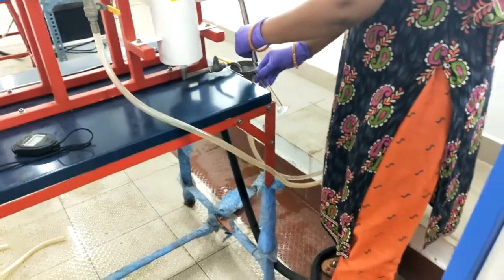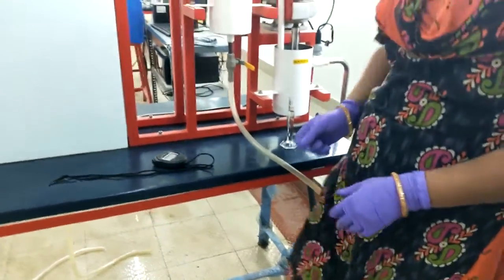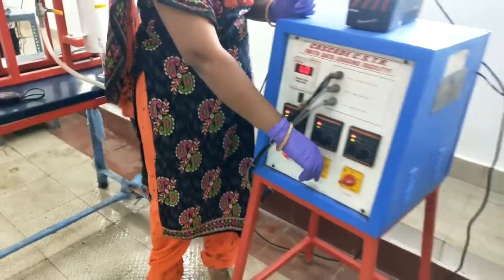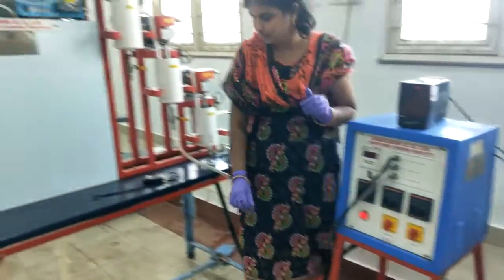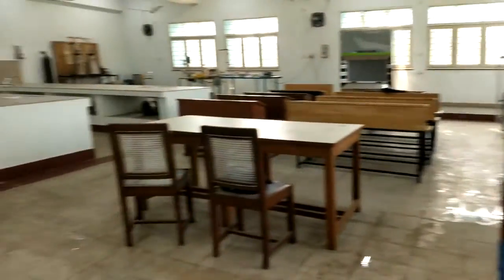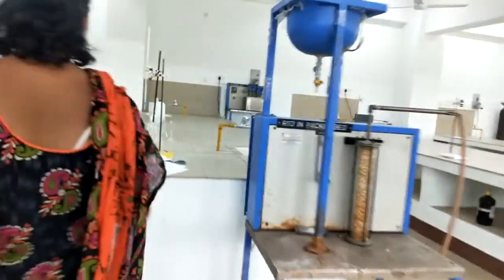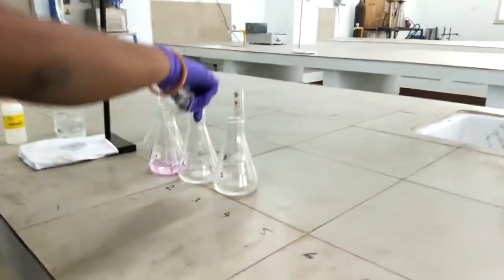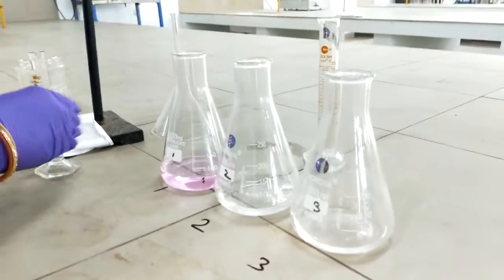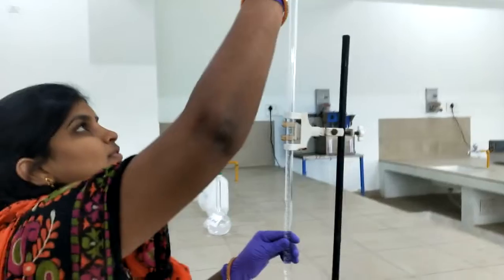Okay, so what we do, we collect 10 ml of sample. If excess is there, we will remove it, and before that we will switch off the motors. Okay, and we will titrate it against NaOH solution. So this is the second one corresponding to 70 rpm. Refill the NaOH in the burette.